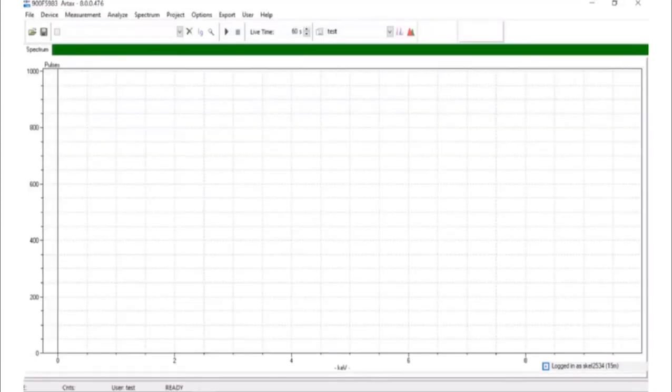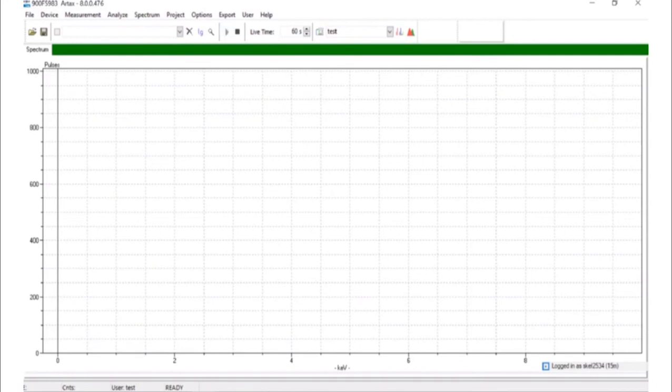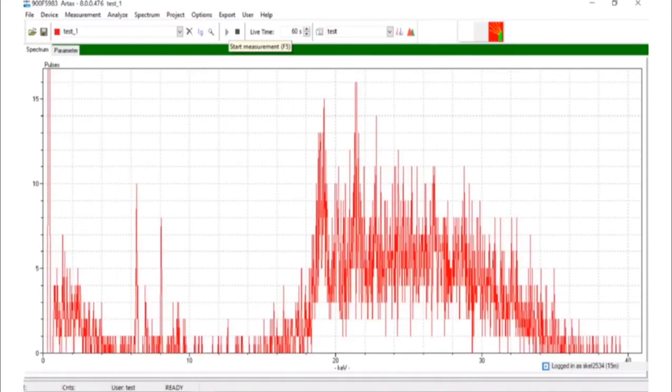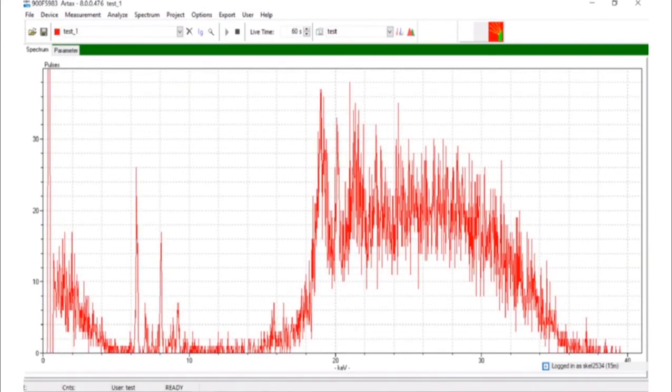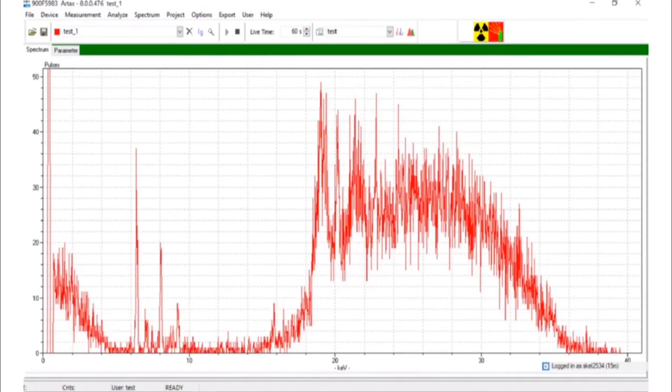To analyse an area, click the play button in the toolbar of the software. The ridge lights will flash red whilst X-rays are being emitted.